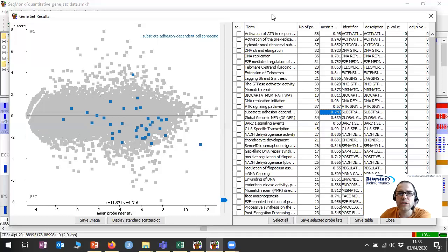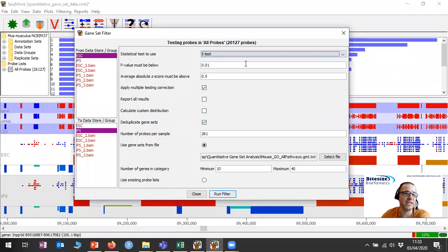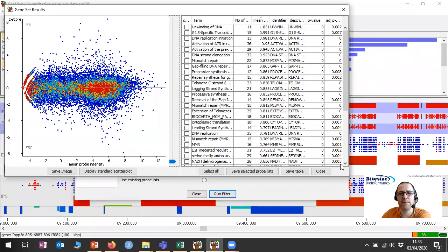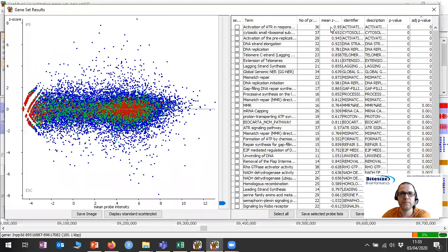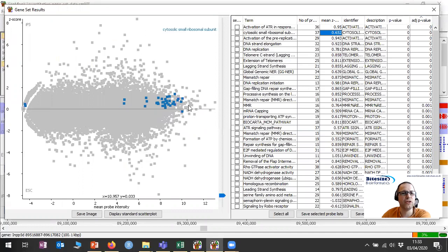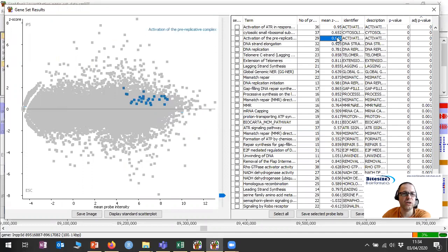I'll just go back and rerun the same thing using the other statistical test. That was the Kolmogorov-Smirnov test — I can go back, change to the t-test, leave everything else the same, and run it again. This should be a slightly more stringent filter in that it's going to care more about the magnitude of change being consistent across a set. Many of these will be the same sorts of sets as before, but with slightly different statistics and more emphasis on the level of change being consistent. Here we only have a Z-score difference of 0.6, which is pretty small, but it's quite a big gene set and they are quite consistent with each other — you can see fewer sets where things fall right out in the extremes, tending to be in the same sort of region.